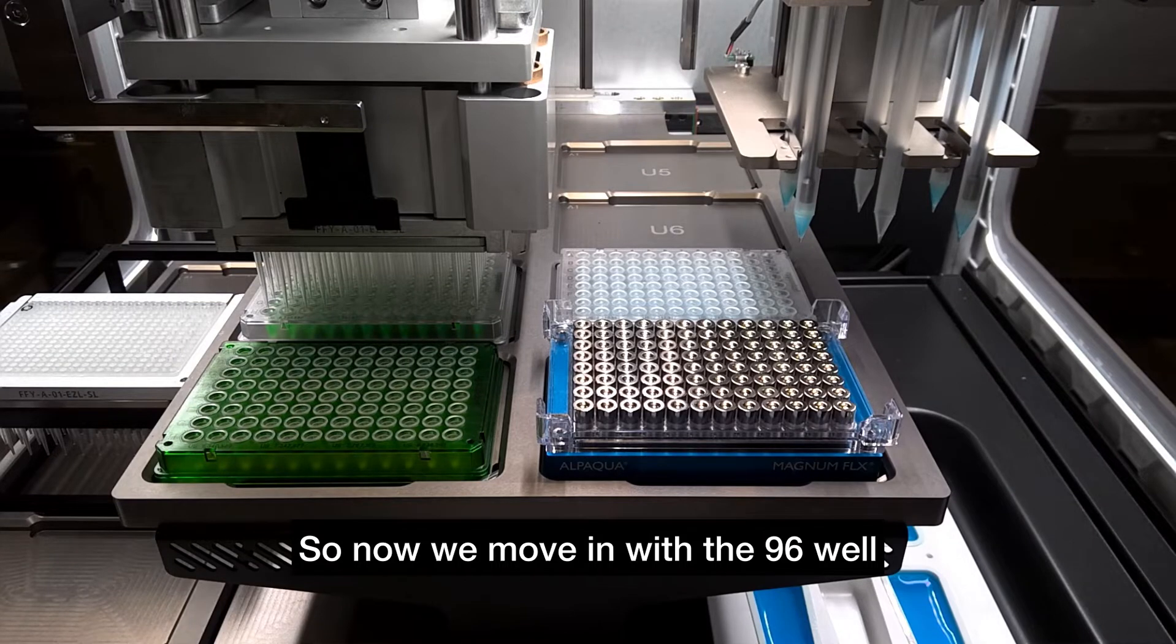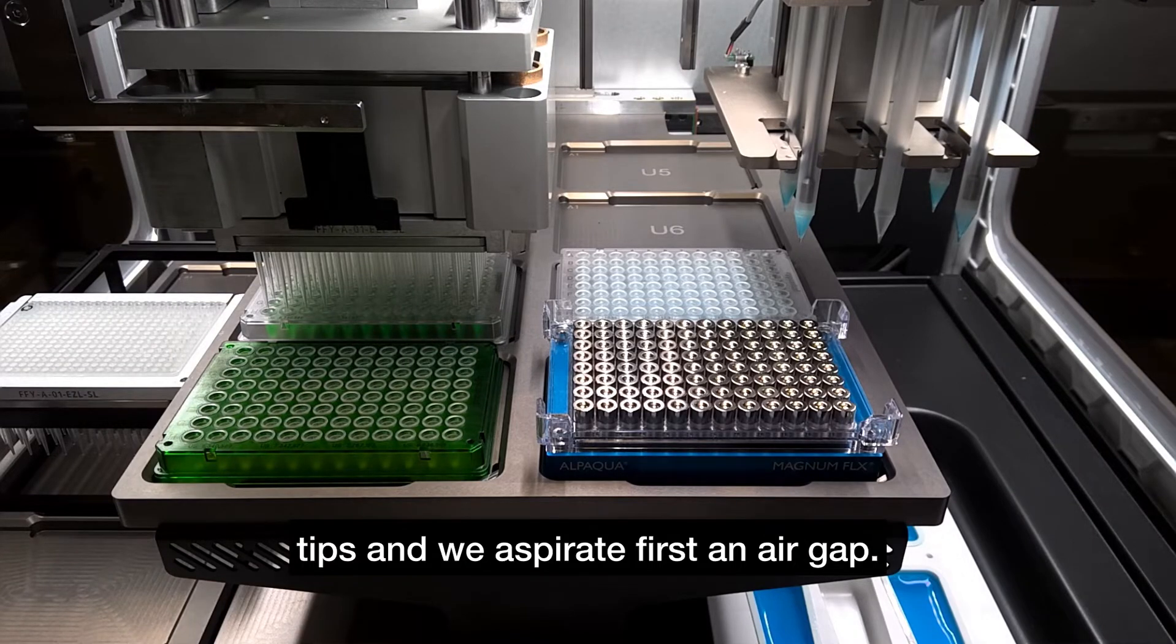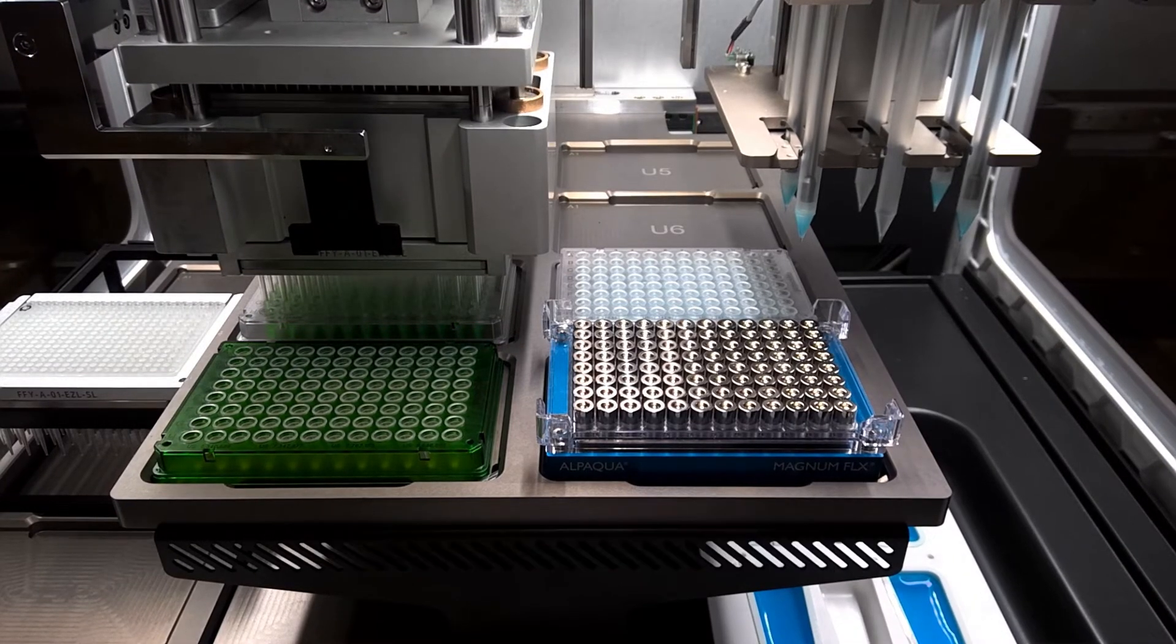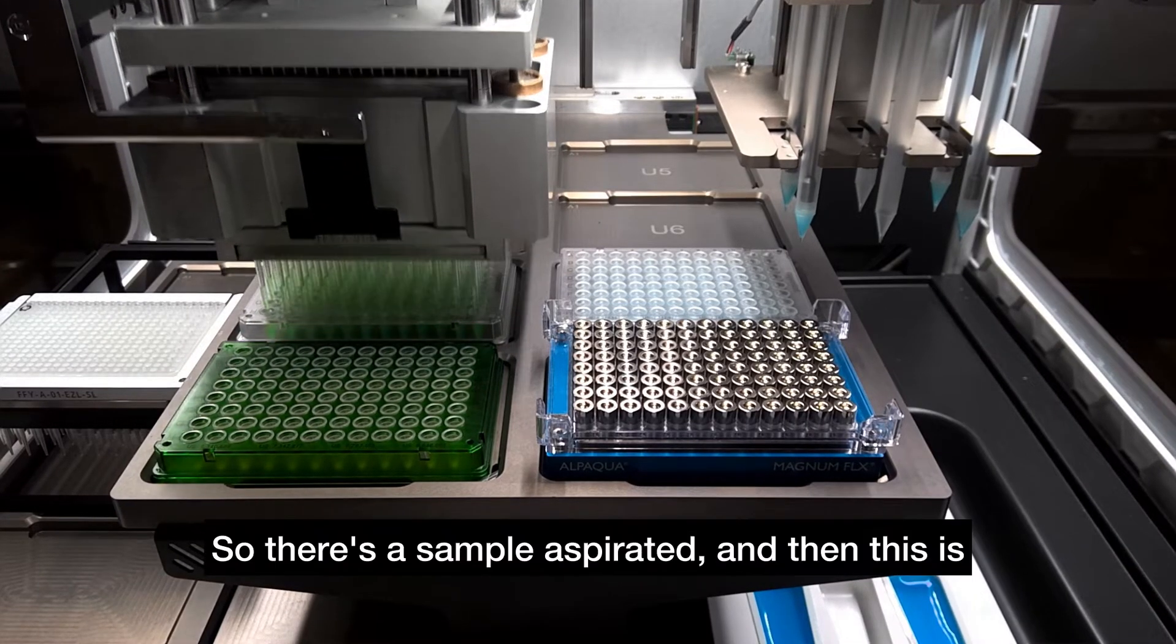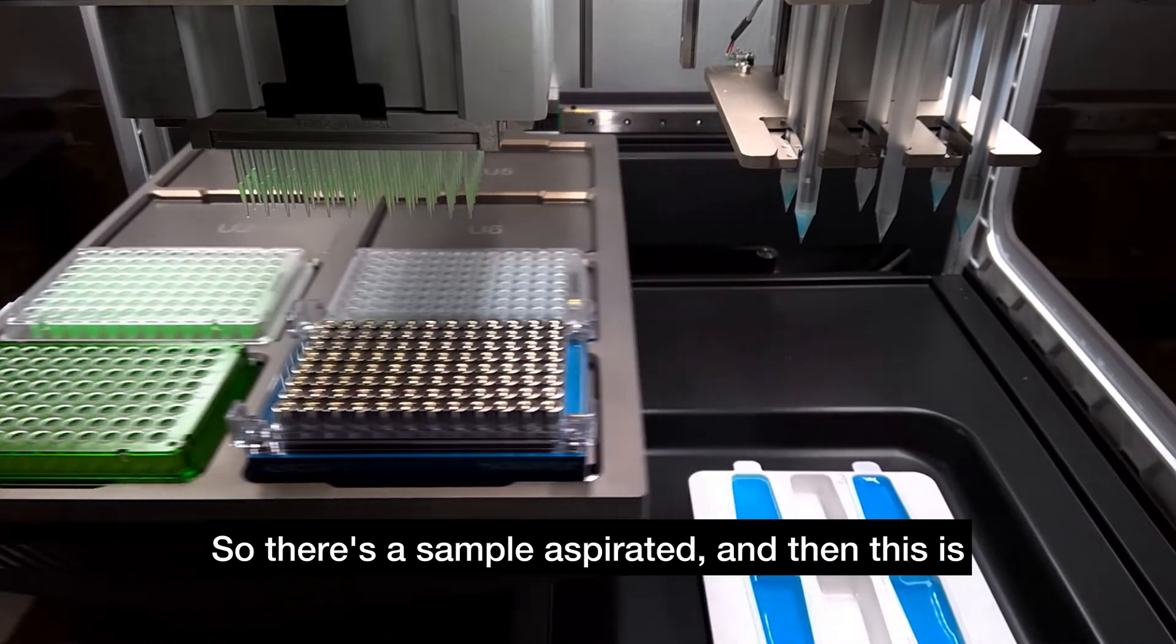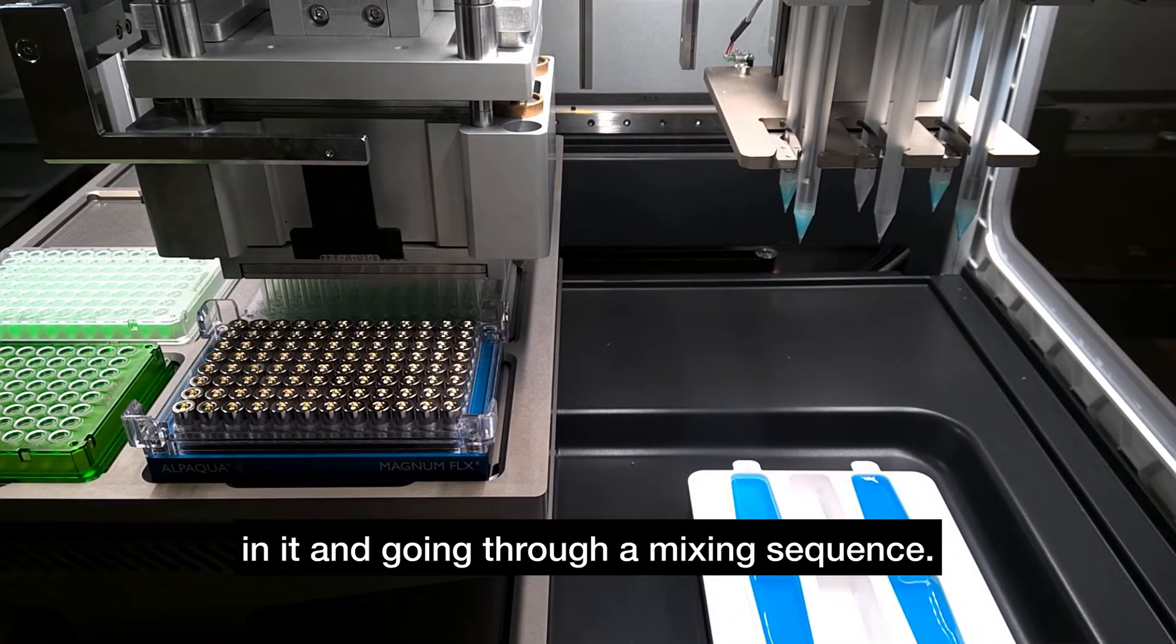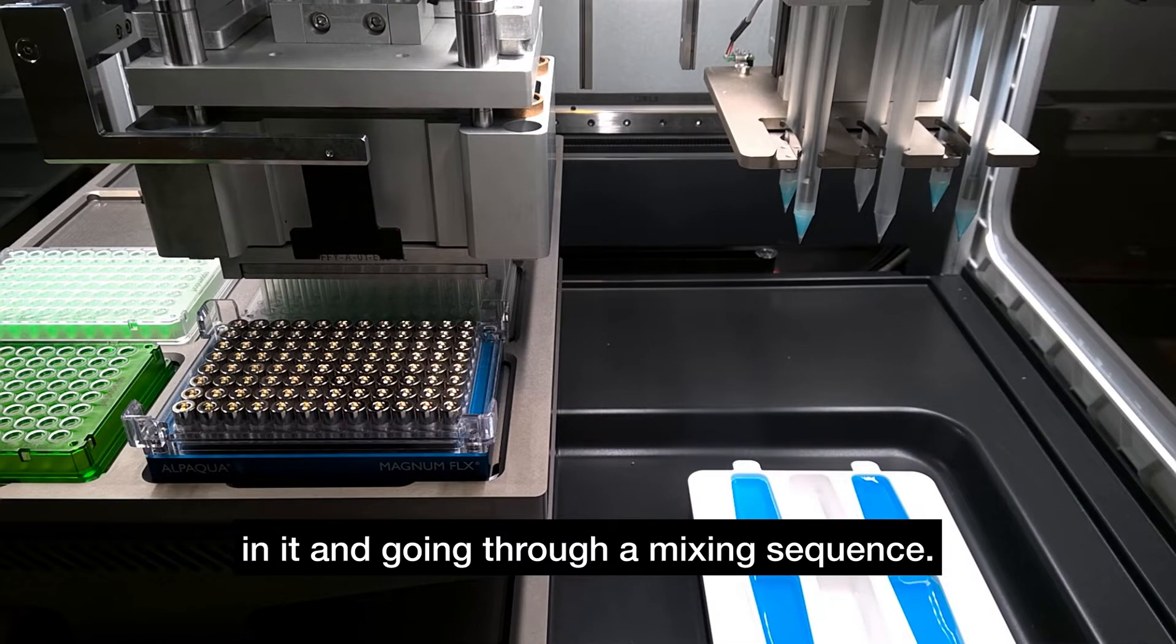So now we move in with the 96-well tips and we aspirate first an air gap, and then we'll be going back in to actually aspirate sample. So there's the sample aspirated. And then this is going over to the plate that has the beads in it and going through a mixing sequence.